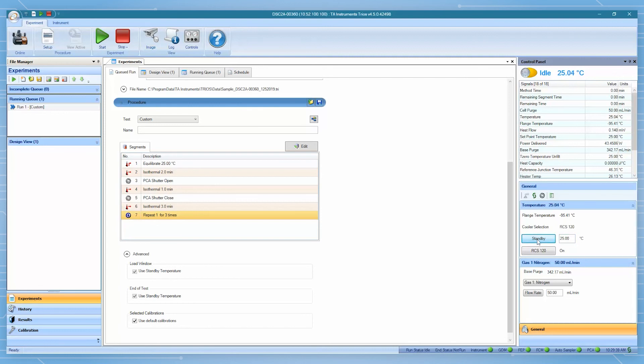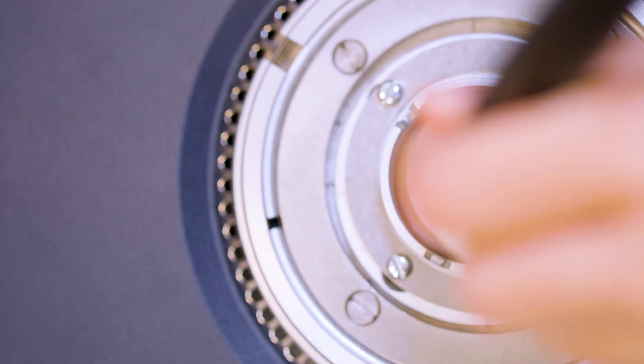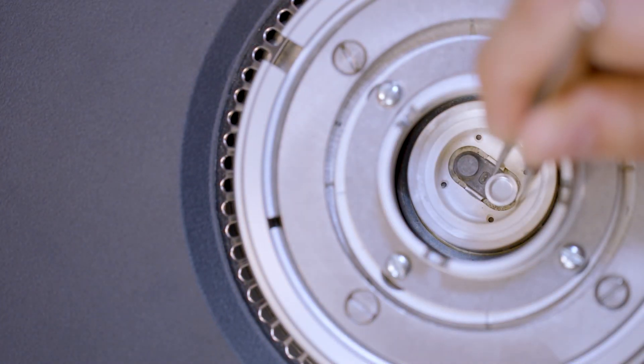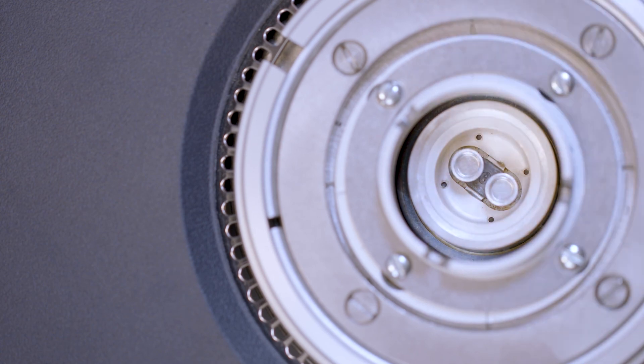To load the sample at room temperature, set the standby temperature to room temperature. Remove the adapter from the light guide. Insert the sample in the front, an empty open pan in the back, and ensure to align the pan in the center of the platform.